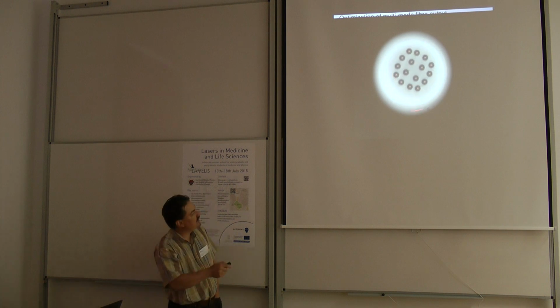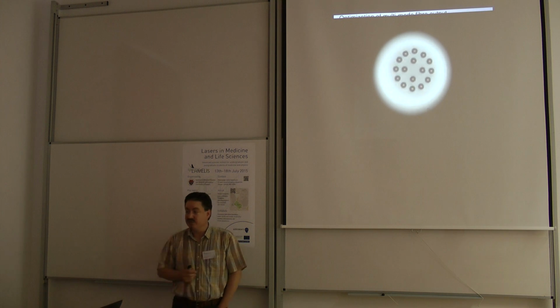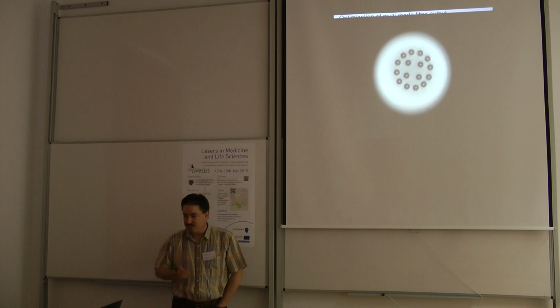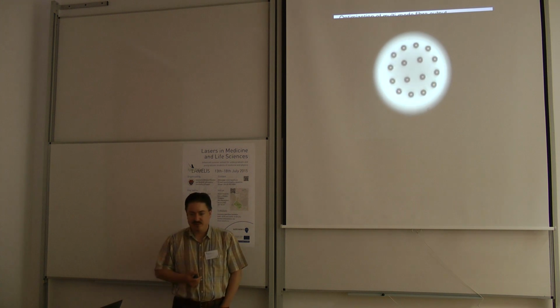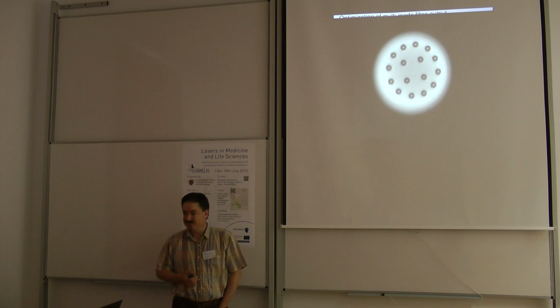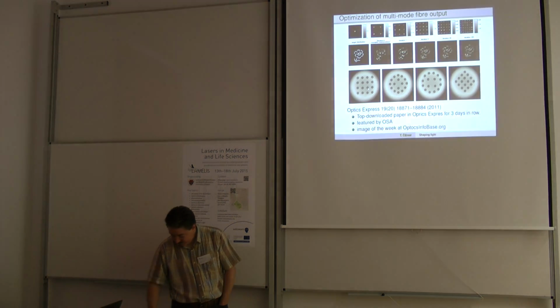And also the white light is delivered through the fiber. So basically this is a total replacement of the objective. You can have fiber-based microscopes without any complexity. The fiber costs about £2 or €3 per meter. So you only need that much to do quite cool things.